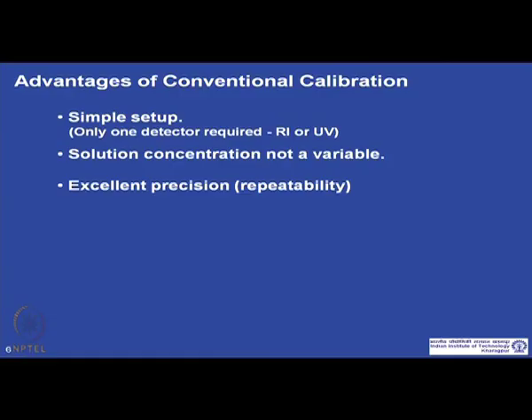So, let us go back and talk more about the calibration. Remember, we did calibration with standard monodispersed polymers. Monodispersed standards mean polymers with very sharp molecular weight distributions, which we injected while recording their elution volumes, and then for the calibration curve we plotted log M versus elution volume VE.